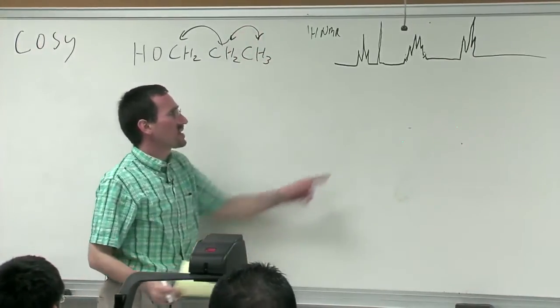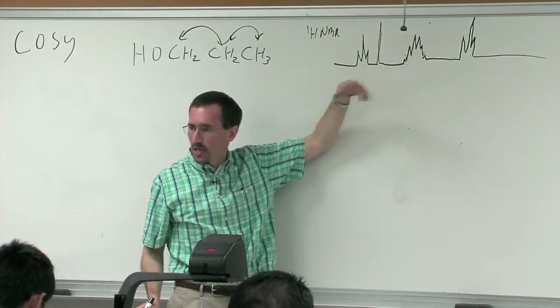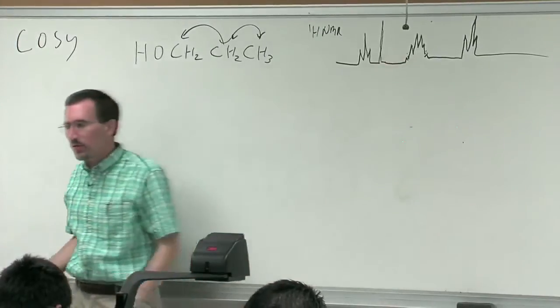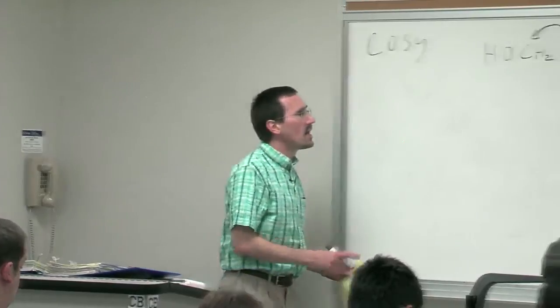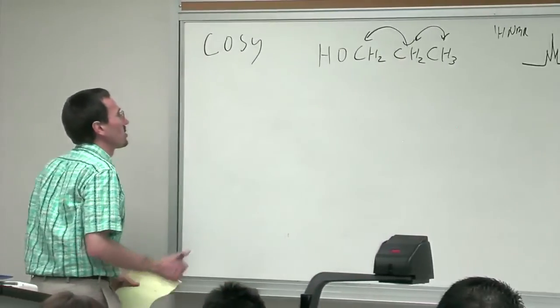And when I have this sextet here, I'm having 1 methylene group with 2 hydrogens. And by being a sextet, I know it's coupling with equal coupling constants to 5 different hydrogens. So for this simple problem, you're very good at reading this. And COSY is providing exactly this type of information, but in a more systematic fashion.